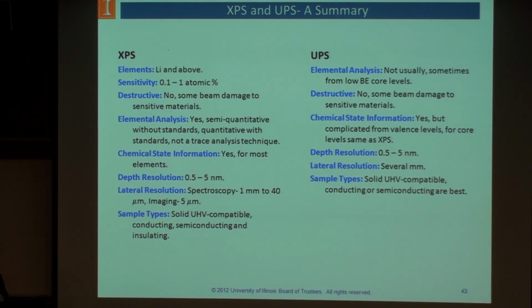Down to a tenth of an atomic percent. Not much materials damage. Semi-quantitative. Chemical state information we can get from most elements. Depth resolution, 5 nanometers or so. Lateral resolution, millimeter to a few microns. Sample types, solid and UHV compatible.